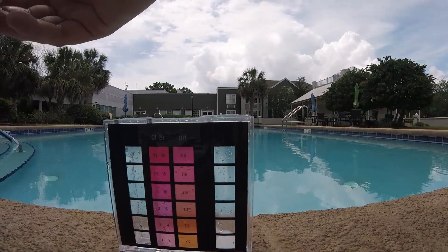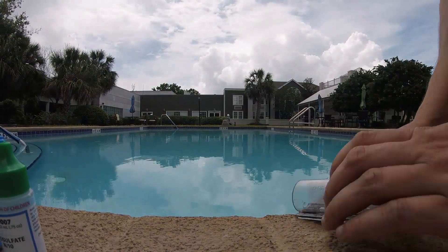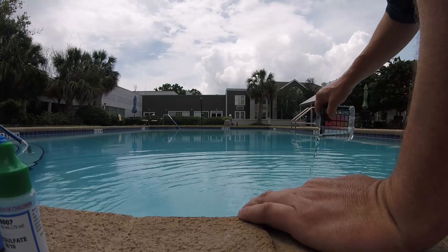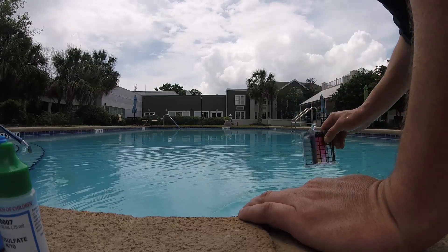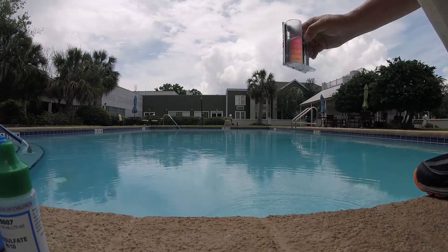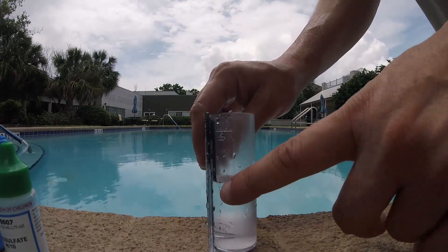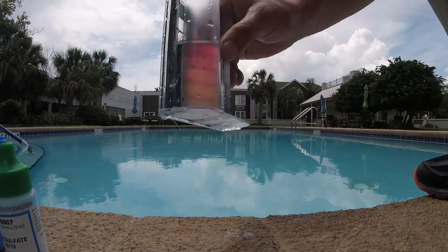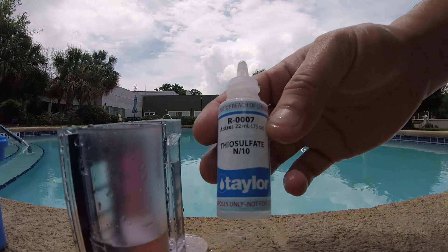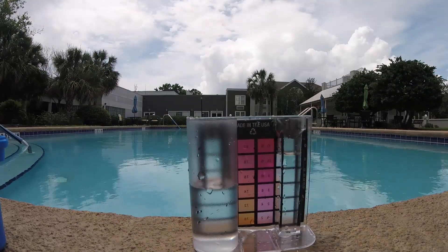The next test you can do — you don't have to do all of these — is the alkalinity test. I always go deep with the samples. Fill it up to the 25 ml mark on the side. You're going to take your thiosulfate, or Reagent 7, and put two drops in there.